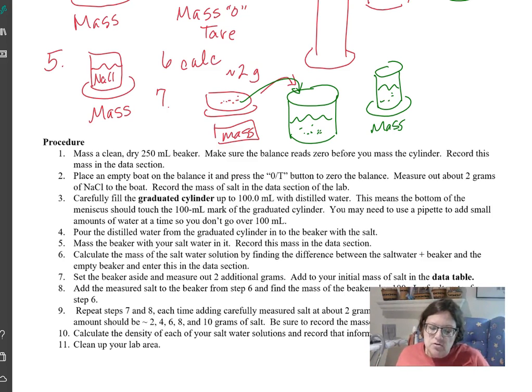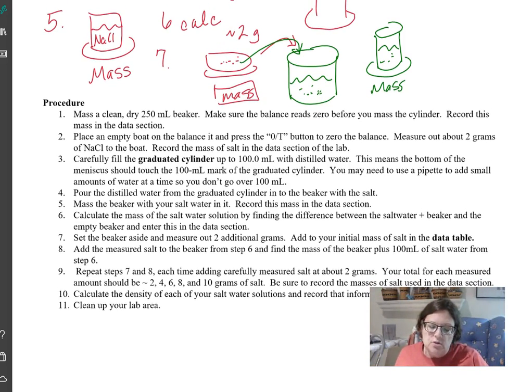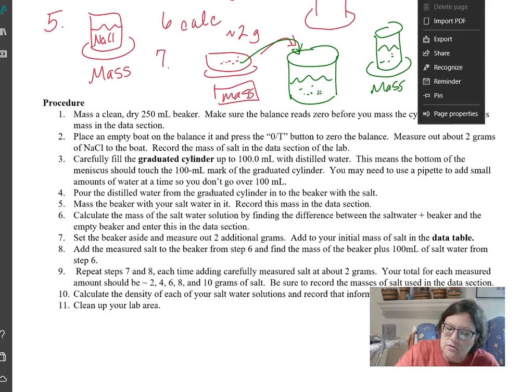Add the measured salt to the beaker from step 6. Repeat 7 and 8 each time, adding about 2 grams. So your total for each measured amount, you should have about 2 grams, 4 grams, 6 grams, 8 grams, and 10 grams of salt. But you're only adding 2 at a time, right? Okay. Calculate the density of each saltwater solution and record that information in your data table.